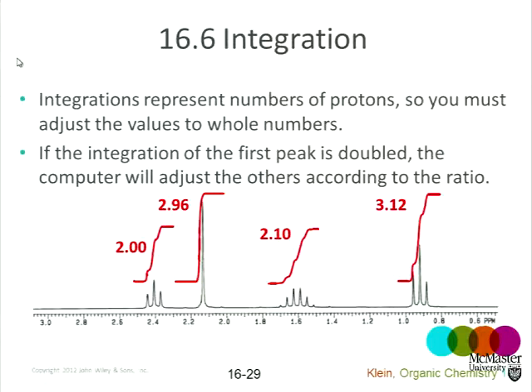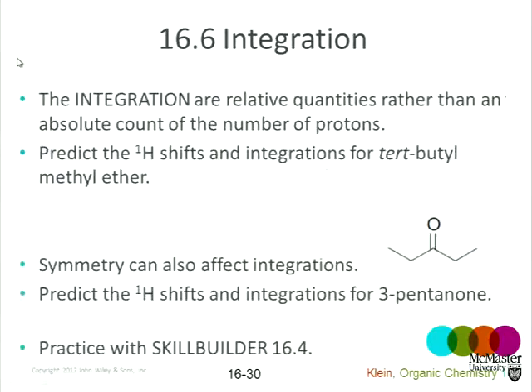Oxygen, right? So, proton NMR helps us, at least at the beginning, in the first phase of the proton NMR, we are learning how to get to a molecular formula. Mass spec doesn't give you a molecular formula, it gives you a molecular weight, right? It's not the same thing. So we need to work from the mass spec, the carbon, and the proton to work our way towards a molecular formula. And certainly practicing can do that.